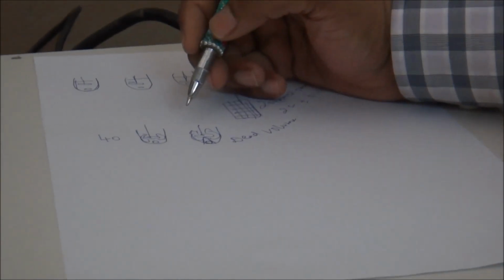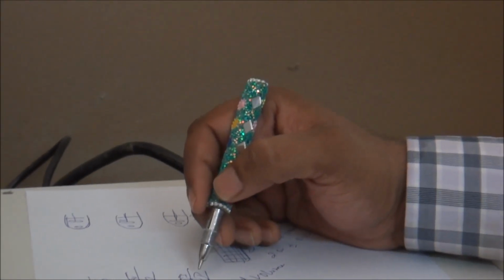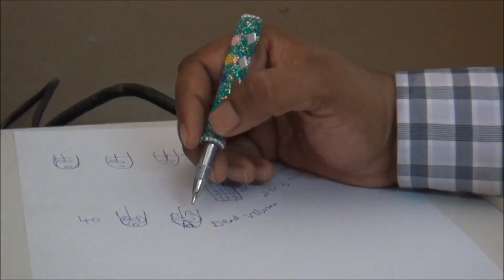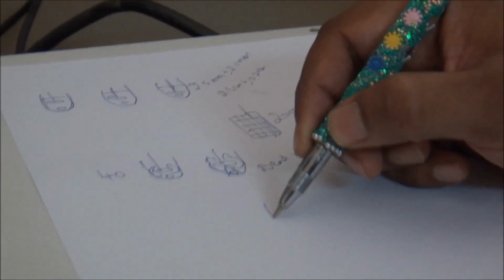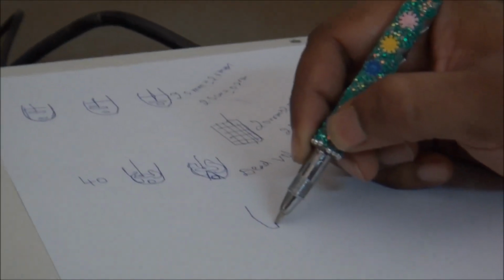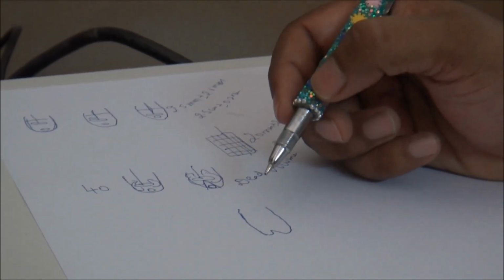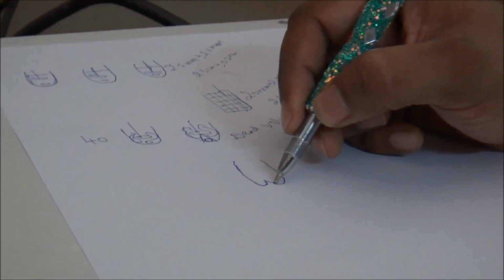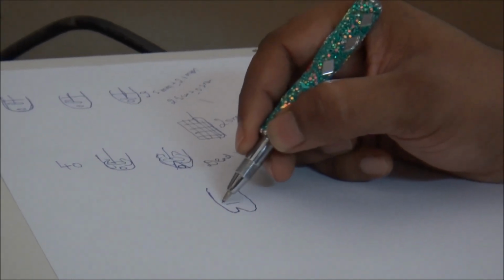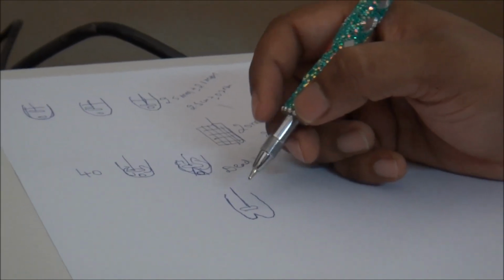Most researchers have studied the occurrence of these dead volumes. To avoid this, there is a solution provided by a company, and that type of vessel is called a peak vessel. These peak vessels are going to reduce the coning effect or dead volume.